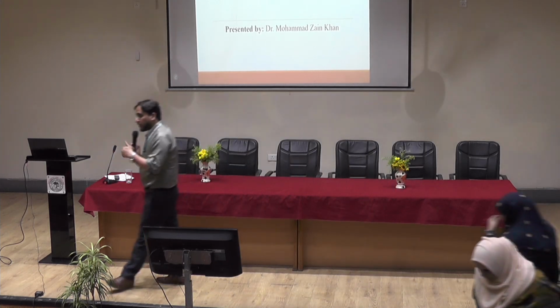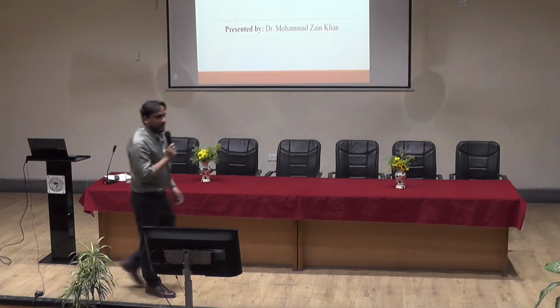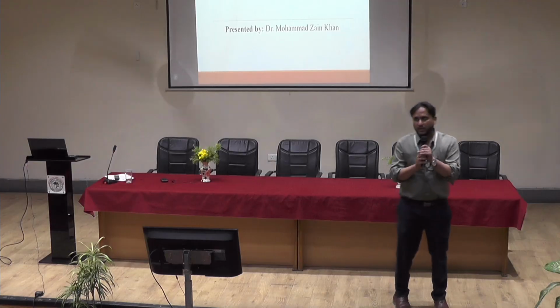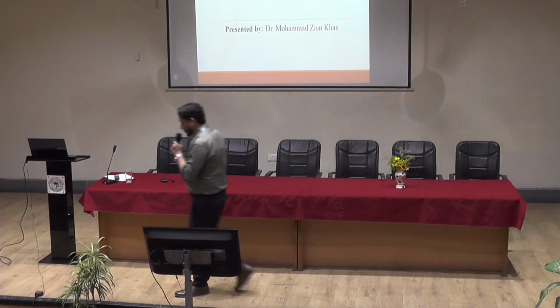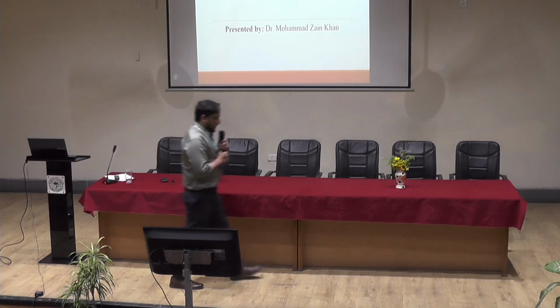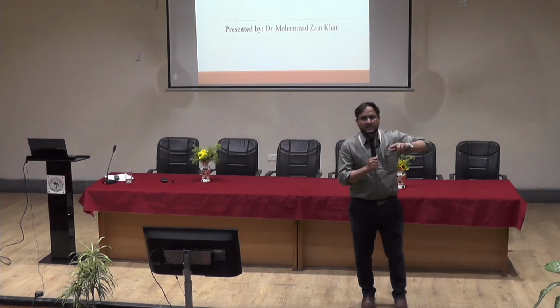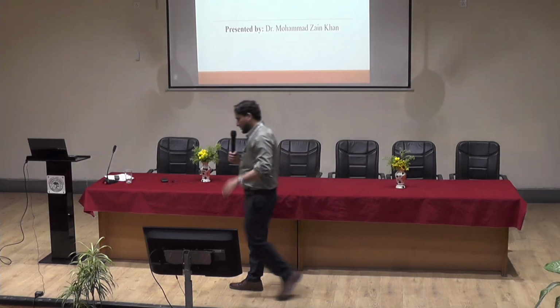The main criterion for a molecule to be active in IR is dipole moment. Similarly, we have polarizability for Raman. If a molecule does not have a dipole moment, it is inactive in IR, but in that case we can use Raman spectroscopy. So both IR and Raman are complementary. Both of these techniques are based on rotational as well as vibrational transitions.